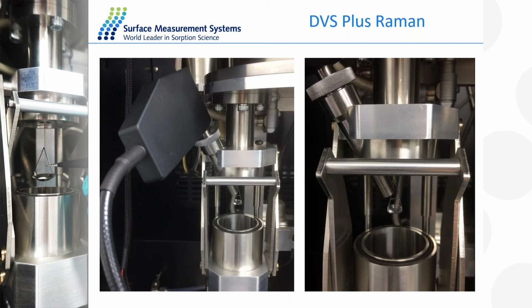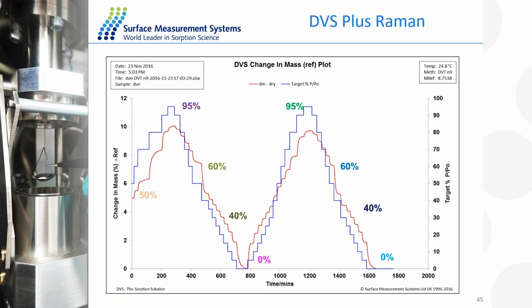So let's look at this experiment from a simple point of view, and then we're going to look at the co-absorption study. A very simple experiment that we can do is something like this: water absorption on a full sample material. Here we start not from a dry condition, but from a storage condition, as this material is usually stored at 50% relative humidity. And we are doing here a two-cycle experiment. We're doing an adsorption and a desorption, and we are repeating the experiment twice.